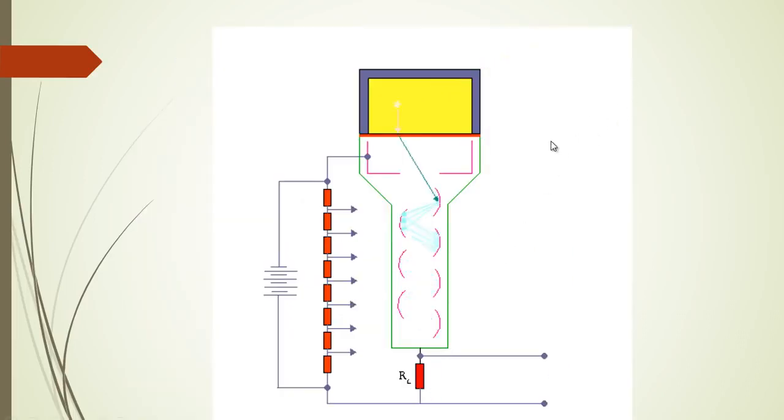Okay, so here is another schematic, or rather an animation showing the working of the scintillation counter. So the radiation strikes the scintillator, which produces scintillation photons, which then fall on the cathode. There is this red stripe over here, and this cathode, since it is photosensitive, liberates photoelectrons which are accelerated towards the dynode, and this dynode will eject secondary electrons which get multiplied into more secondary electrons over here, and so on.